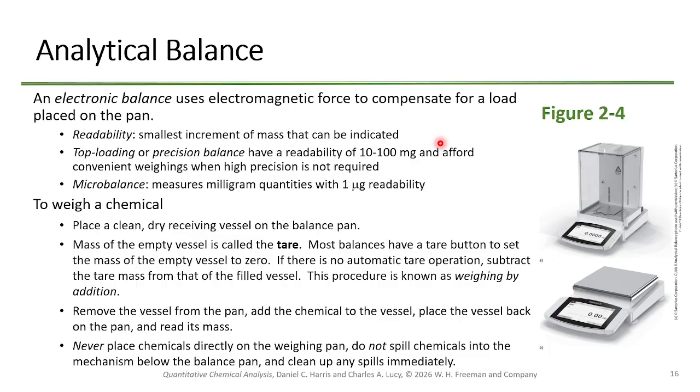Okay. Let's say you're resisting the force of a load, and I try to weigh an elephant with you. Are you going to be able to resist the force of that load? No. And so there are cutoffs on here. Every analytical balance has a maximum weight it can weigh.